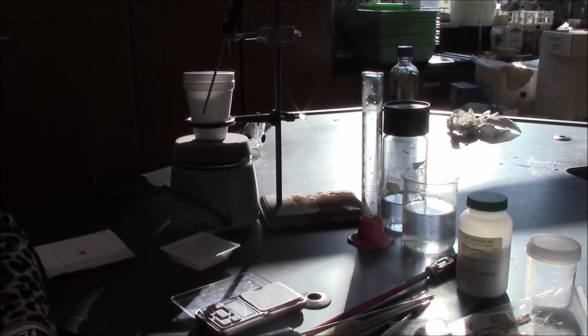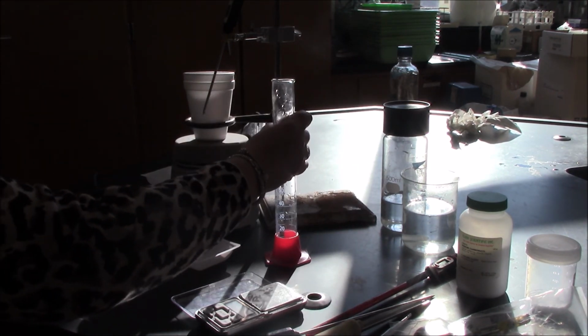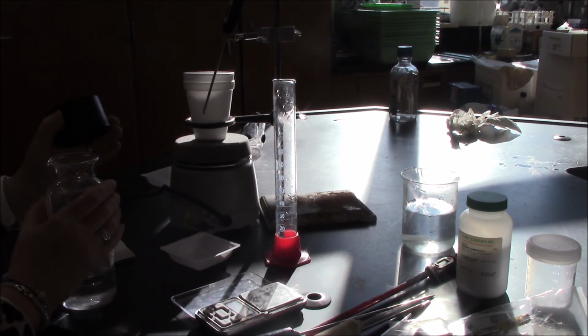Now I have 6 substances that I'm supposed to be testing. For time's sake, I am only going to show 1, but I will provide data for all 6 once we start to move through computation and analysis at the end of this lab. The solid that I'm going to be working with is sodium carbonate, Na2CO3. To start, I'll take my graduated cylinder and measure out a volume of 50 milliliters of water.